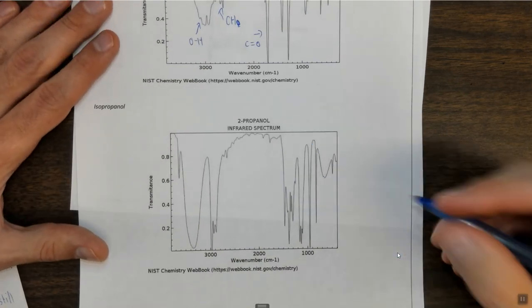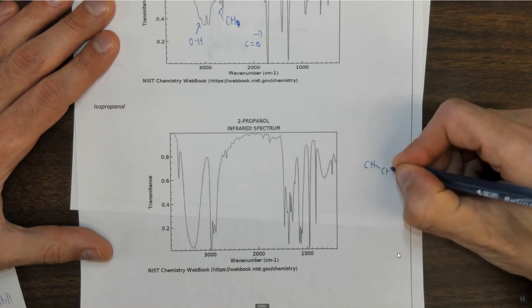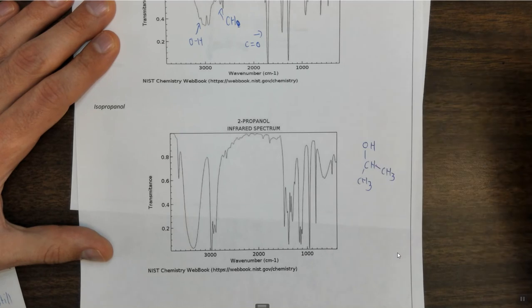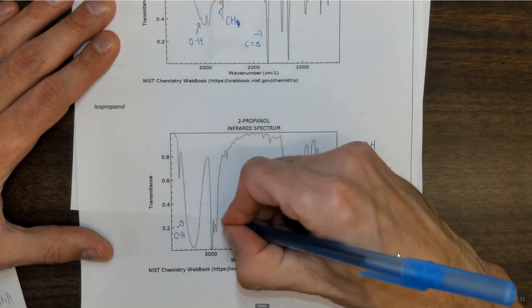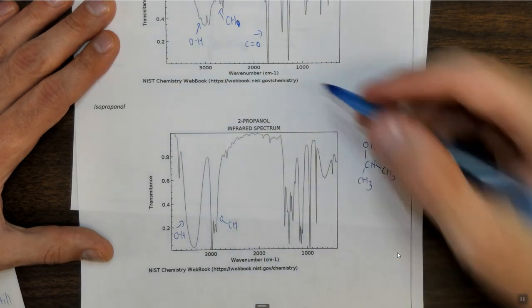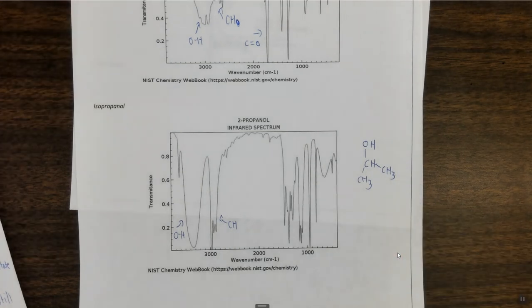Now let's look at the next one. Let's look at 2-propanol. 2-propanol is CH3, CH, CH3, bond OH. In this case, we have an OH here, we have the CH here, and notice what we don't have. Between 1700 and 1800, we have no carbonyl, which makes sense because there's no carbonyl.